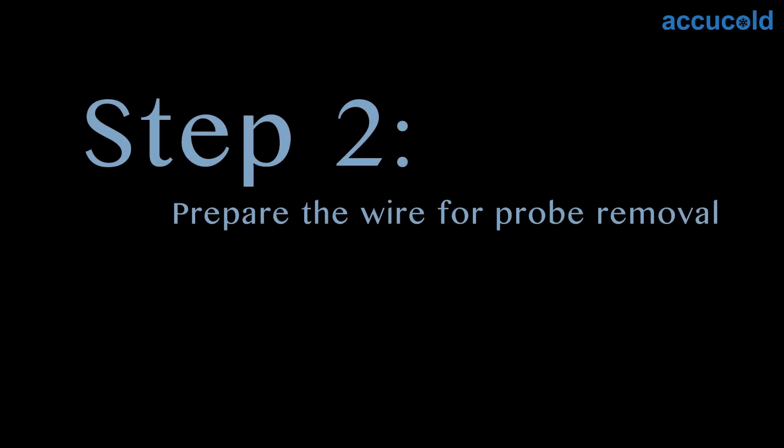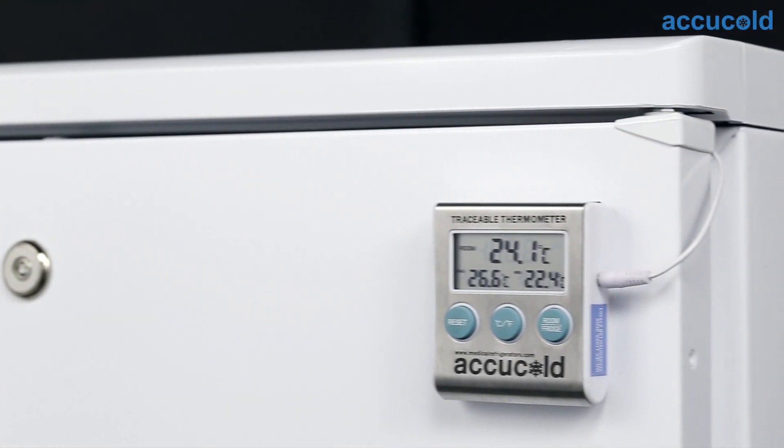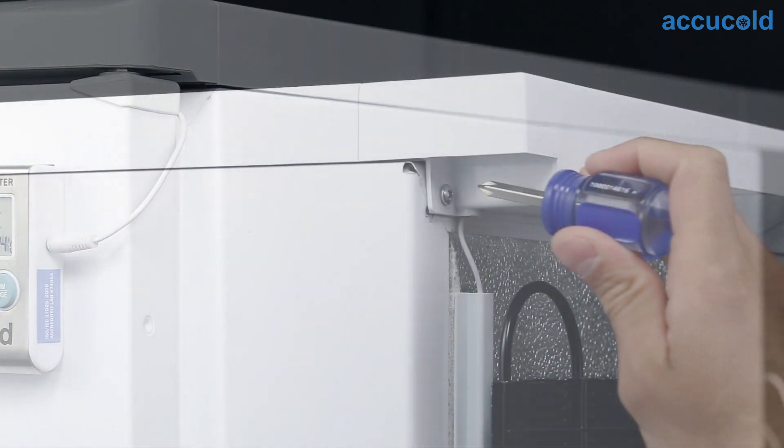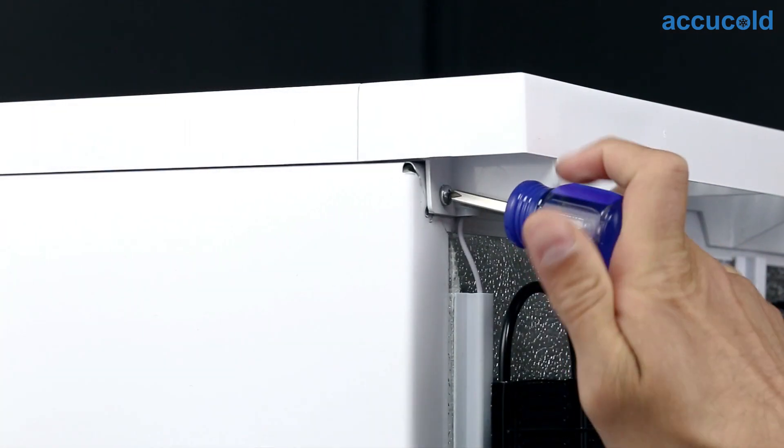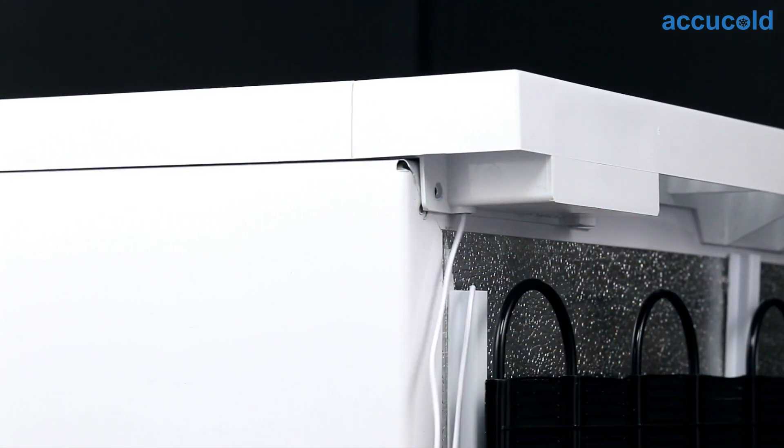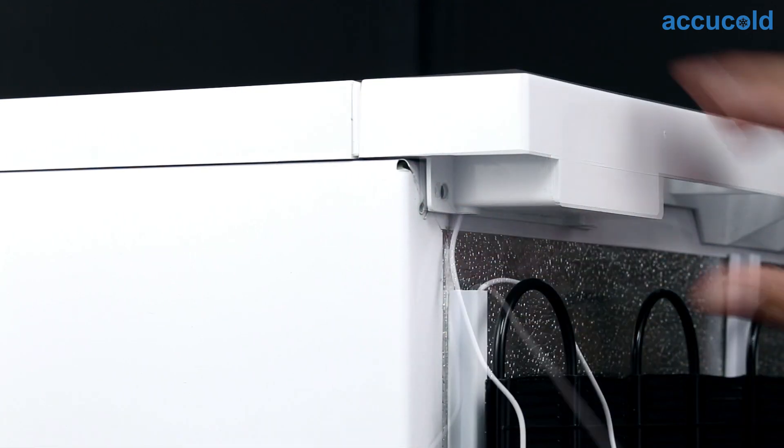Step two, prepare the wire so you're able to remove the probe. Begin by finding the wire's path to the back of the unit. If the wire runs through the tabletop, loosen the tabletop by removing the top left screw on the back of your appliance. Gently pull the wire through the tabletop.